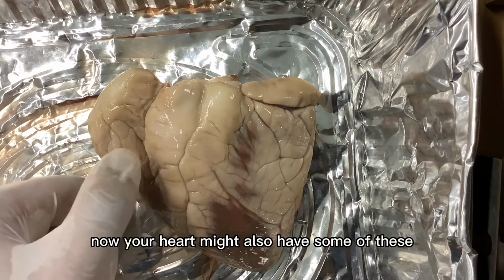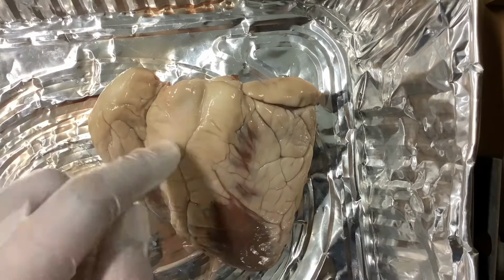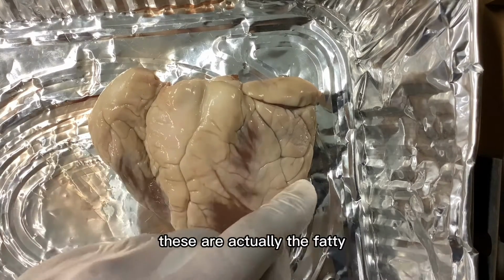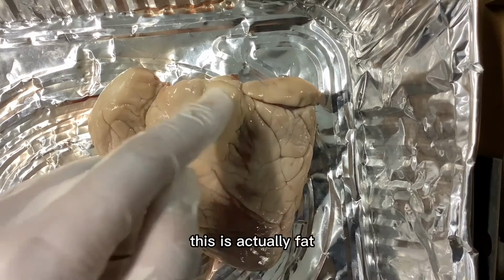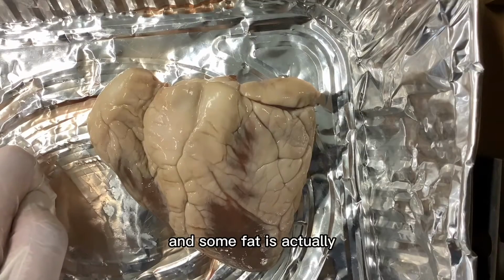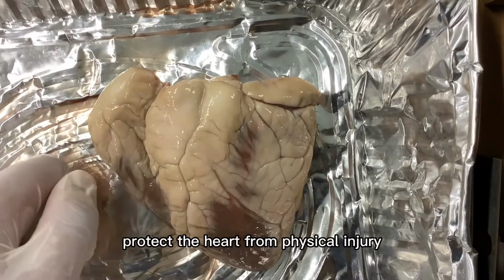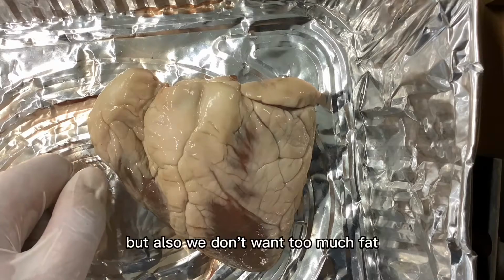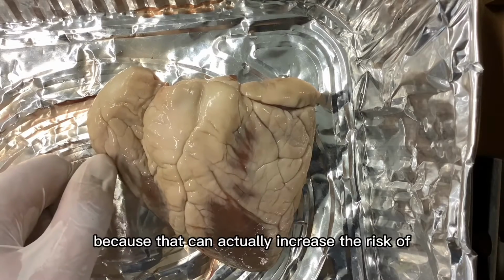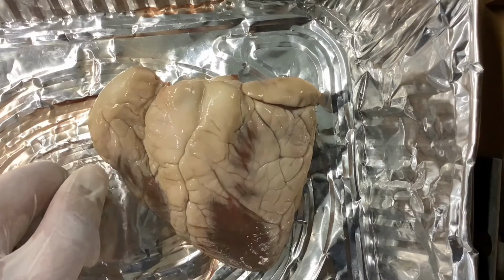Your heart might also have some of these white deposits that surround them, and you might have guessed that this is fat, or fatty deposits, that surround the heart. Some fat is helpful because it helps to protect the heart from physical injury. But we also don't want too much fat because that can increase the risk of heart disease.